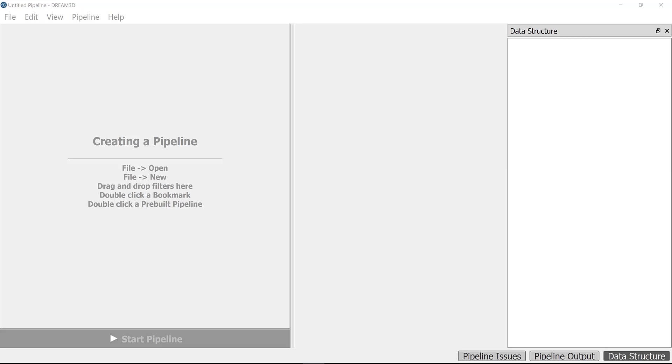Hi everyone, I'm Reza and this is video number six of the PRISMS Plasticity online tutorial. In this video, we will go over how one can generate the macrostructure for PRISMS Plasticity using DREAM.3D from an EBSD file.